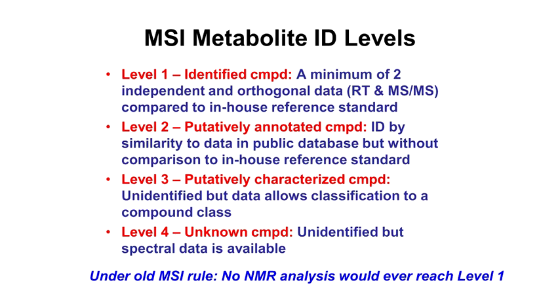Most people are about this level 2, where you identify a similarity to a public database like HMDB or BioMagResBank. You may not have an in-house standard. Now, if you can spike in an authentic standard into your mixture, then you've achieved level 1 identification according to this method. But there's also been some wide discussion within the community that if you do the proper deconvolution, using, say, Chenomx or Bayesil, you also have reached a level 1 standard because you're not measuring against one peak, as you are typically with mass spectra, or one retention time.